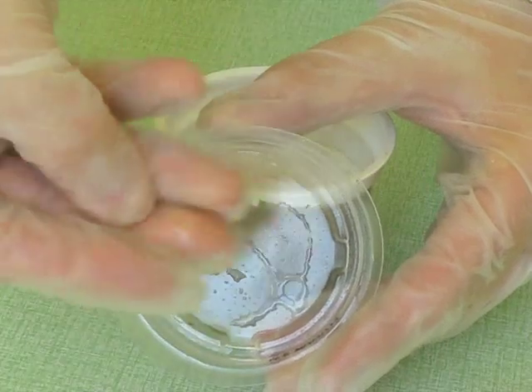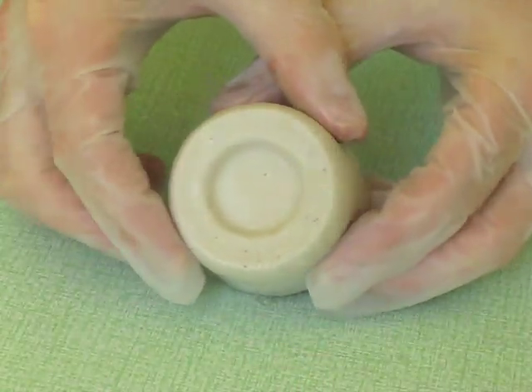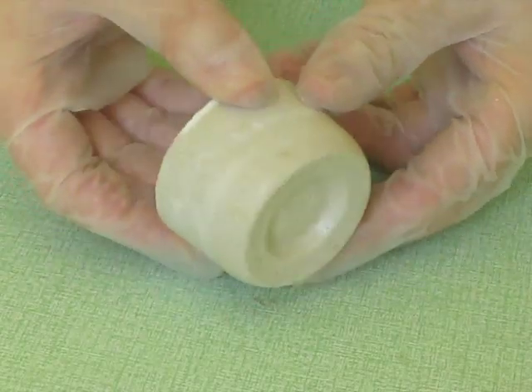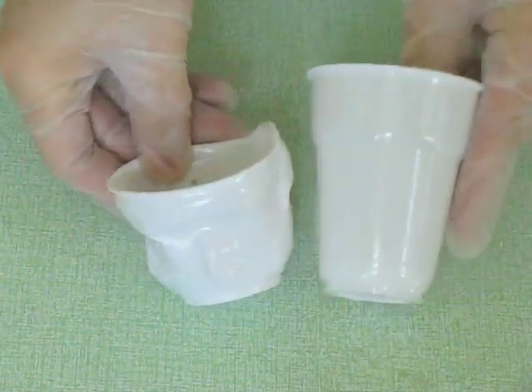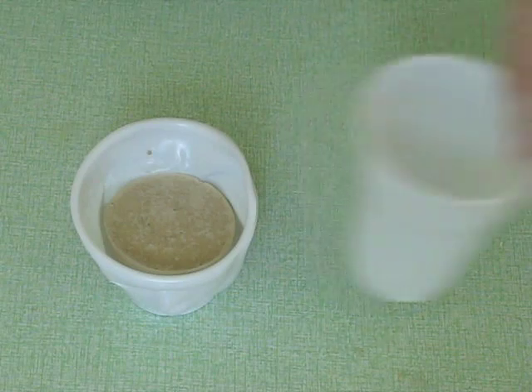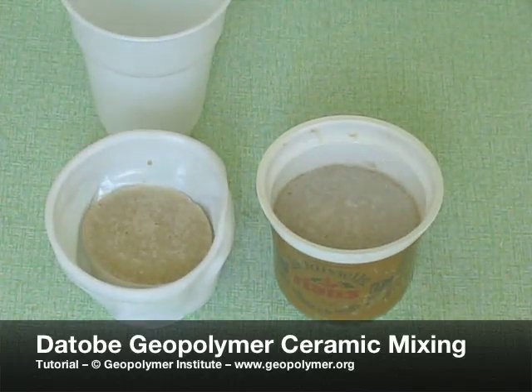It is a good sign of geopolymerization. Even heated at 60 degrees C, this plastic cup in polystyrene did not withstand the 110 degrees C exothermicity of the geopolymeric reaction. So, use plastic molds that support such temperature.